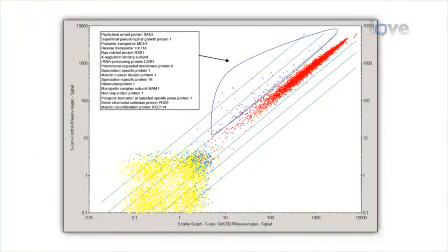Ultimately, results can be obtained that show the expression differences in the two yeast samples, and through bioinformatics demonstrate the power of microarray analysis to undergraduate students.